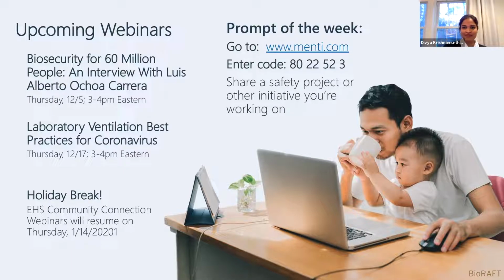So we actually had to forward think and realize that next year, hopefully when the pandemic is behind us, we would need to pad the budget a little bit. For us, I wouldn't necessarily call it that, but where I think we've been stressing is really with respect to waste. For example, training people on what is really waste. What are you disposing? Does it need to go there? Kind of cradle to grave, putting a little more stress on that, because now we have the time to help people out with trainings, et cetera, because they're doing a lot of that themselves.